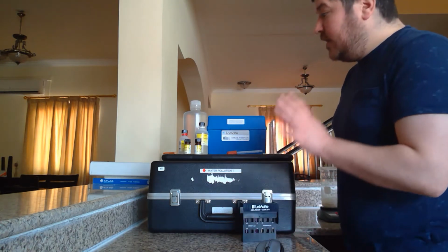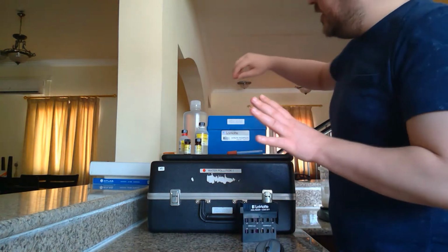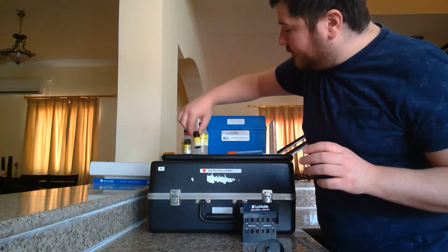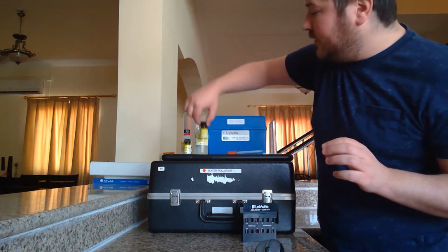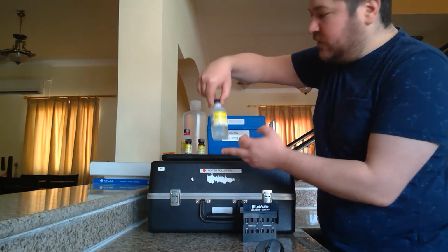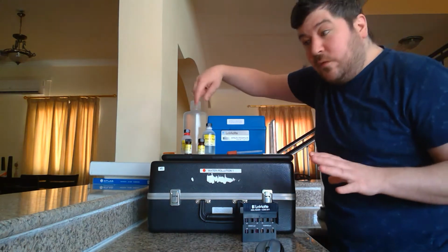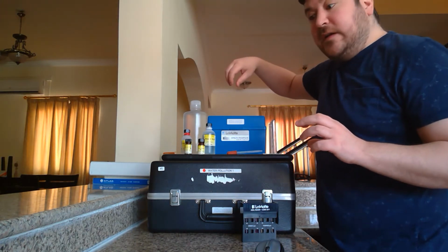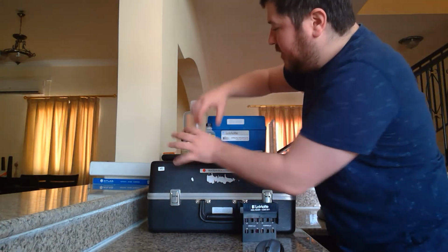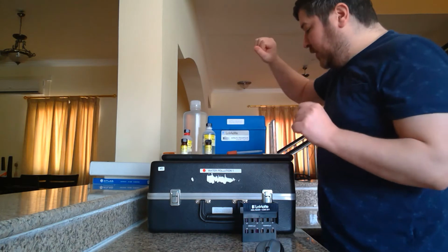So in the kit, there's 2 tests in here. It's pretty easy. I have the phosphate acid reagent along with the phosphate reducing agent. I have a nitrate reagent and then mixed acid reagent. And I'll go over these 4 chemicals as I do the experiments. So the nitrates and the phosphates are part 1 and part 2 of this.